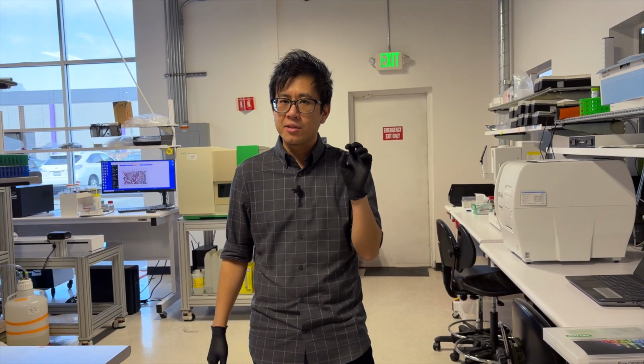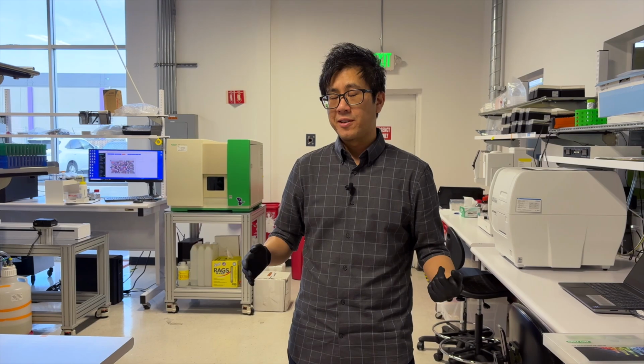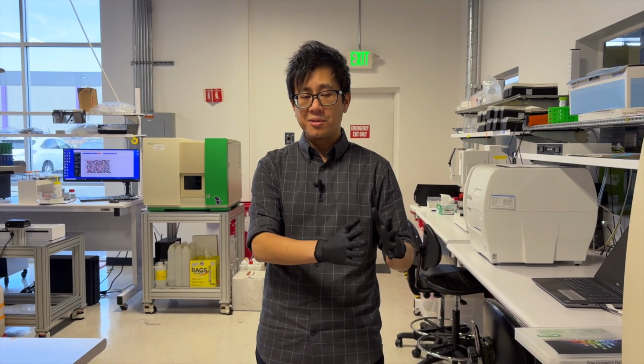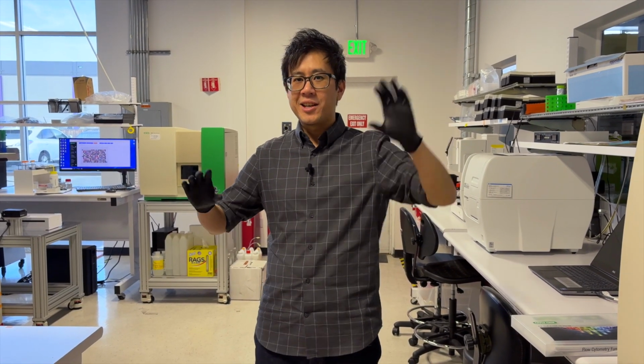Sure, find the things that you do a lot, maybe productionize them, try and build them into a system, turn them into a menu of items that you can make into a modular workflow. For example, our main screen, to highly simplify it, is do a lot of drugging to a lot of cells and then read them out in flow cytometry. And some of those bits we'll do over and over again. And so that makes it pretty modular.